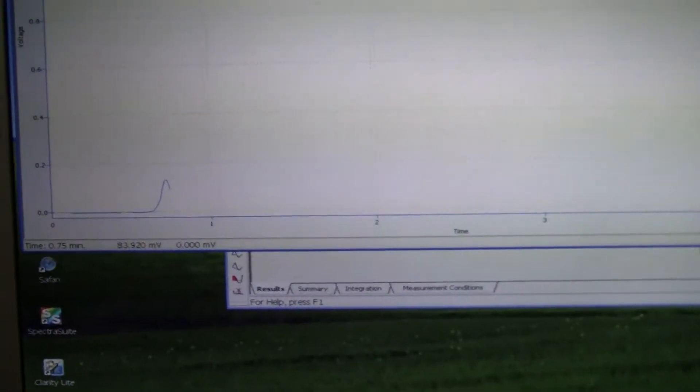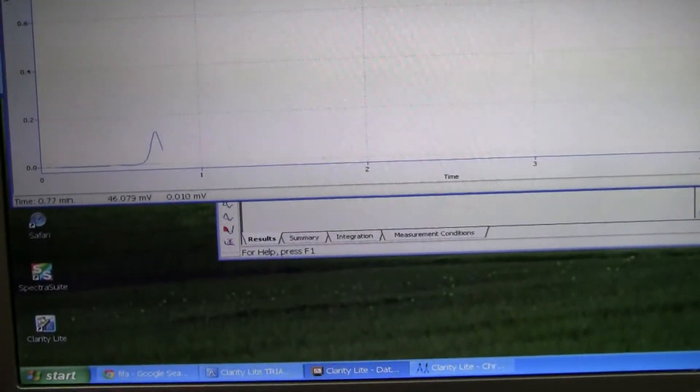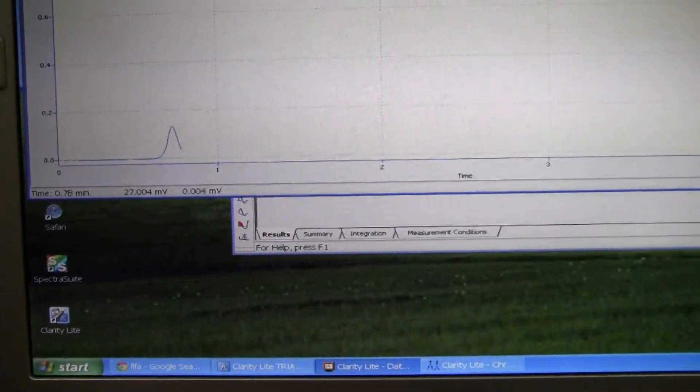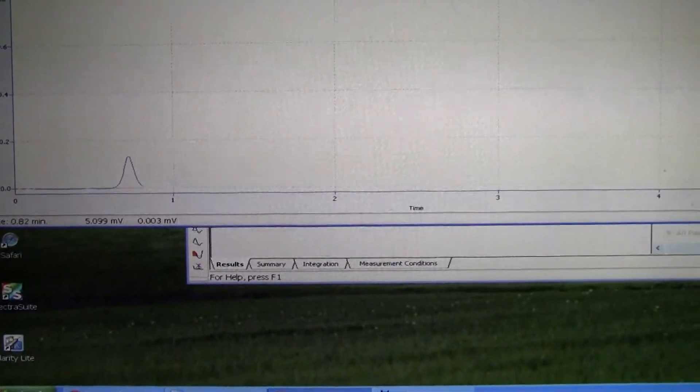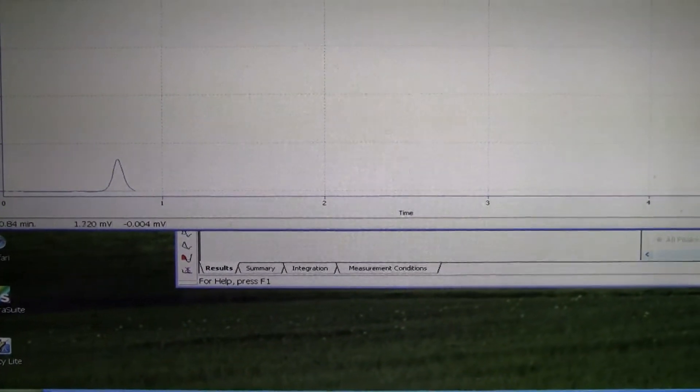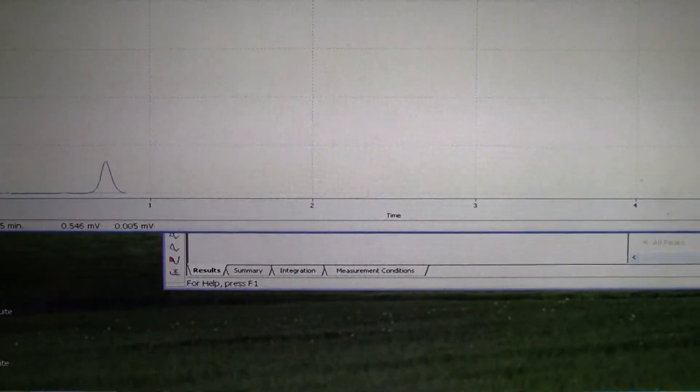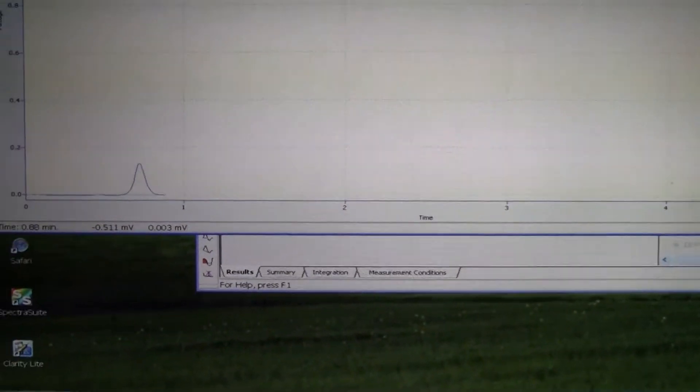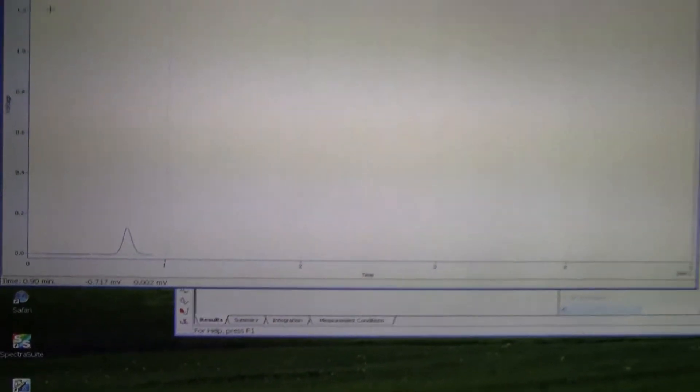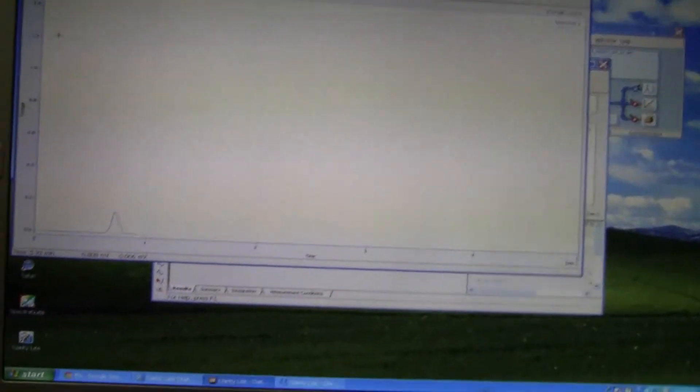And this should be translating onto our computer system. Fantastic.